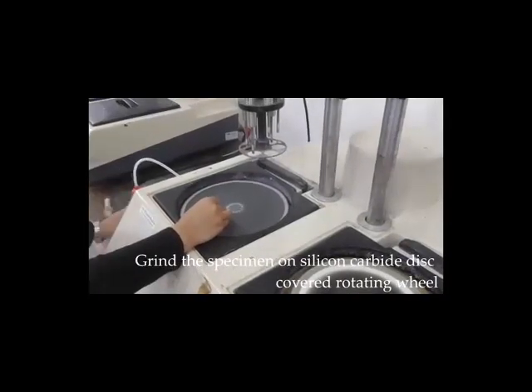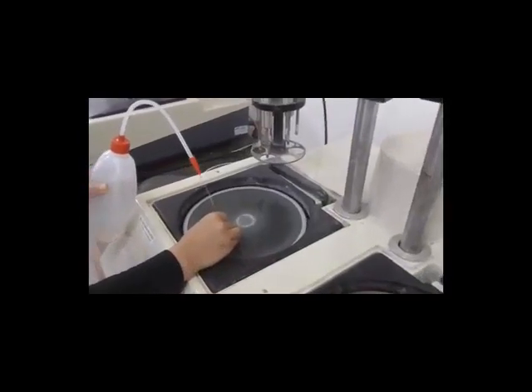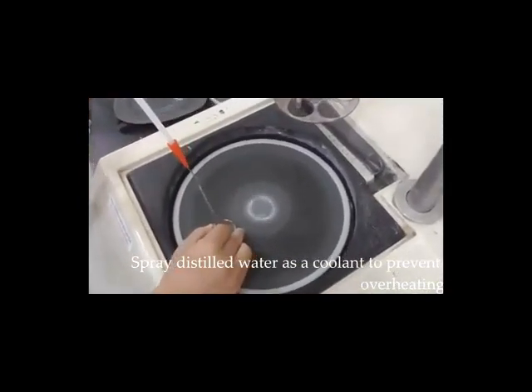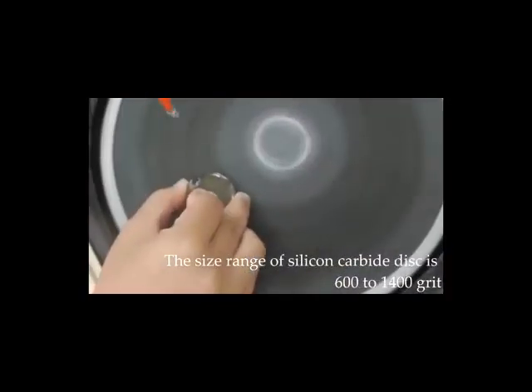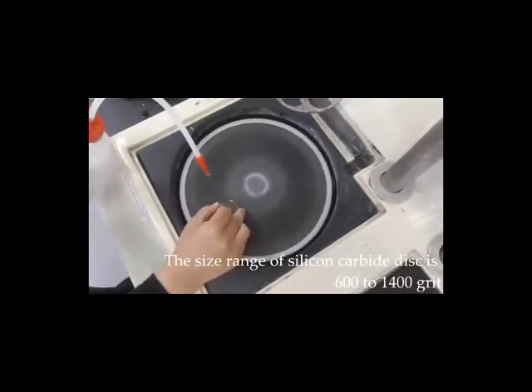Grind the specimen on silicon carbide disc covering the rotating wheel. Spray distilled water as a coolant to prevent overheating. The size range of silicon carbide disc is 600 to 1400 grit.